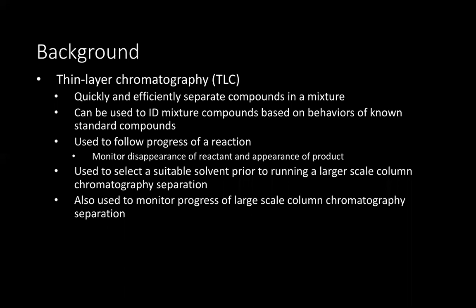All right, a little bit of background. TLC stands for thin layer chromatography. It's a really efficient way to separate compounds in a mixture and can be done relatively quickly compared to other methods of chromatography that we'll talk about later this semester.